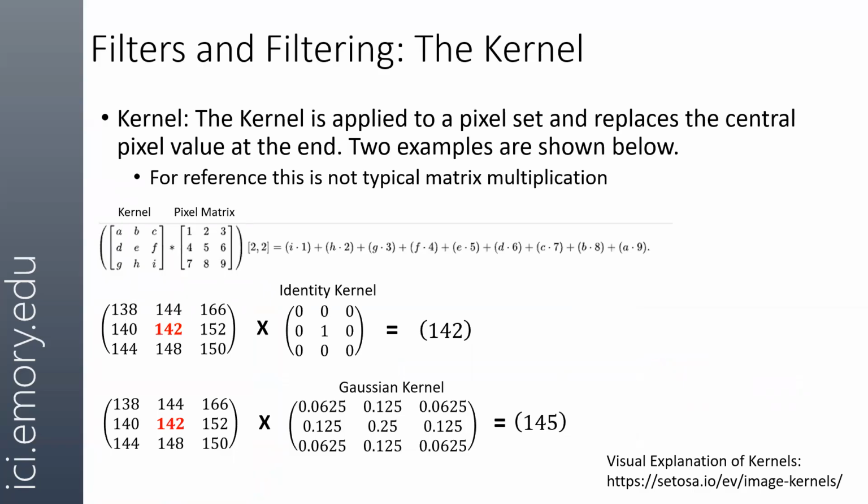We can skip this, but for those who remember matrix multiplication, that is not how the kernel operates. It makes it very much more confusing. But we don't need this, we can skip this.